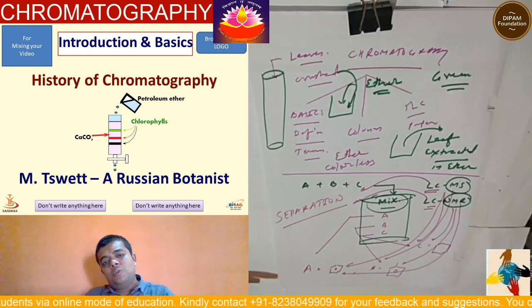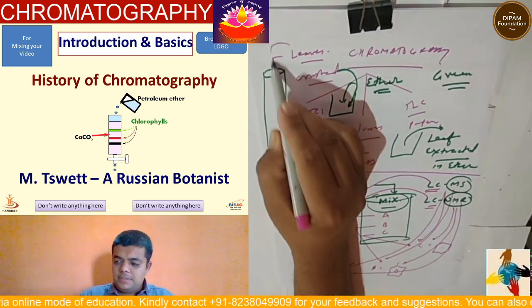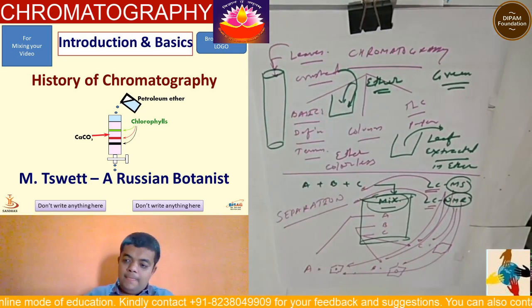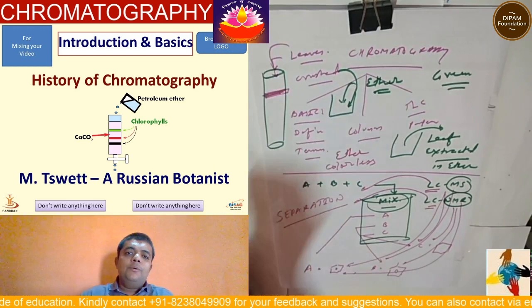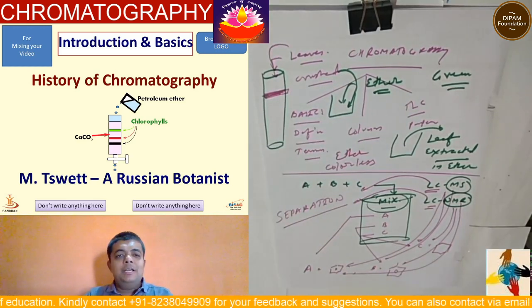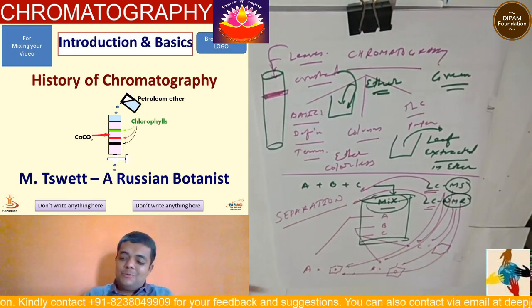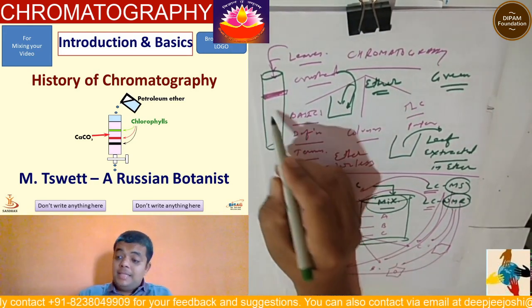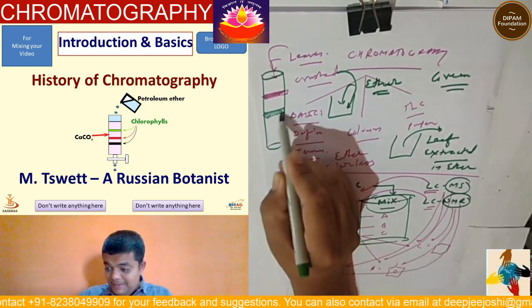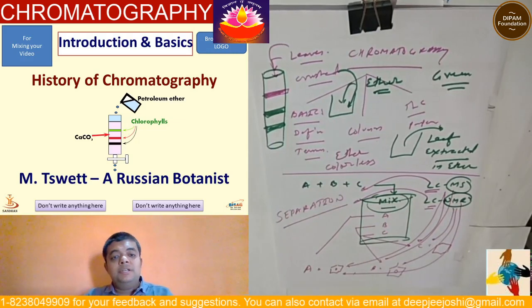This extracted solvent was then poured through the top of this column. If it was just made up of a single component, which generally from our school days is popularly made known to us as chlorophyll, it would have shown a green patch. But to your utter surprise, there were more than one patch coming inside. It means there were more than one component present.